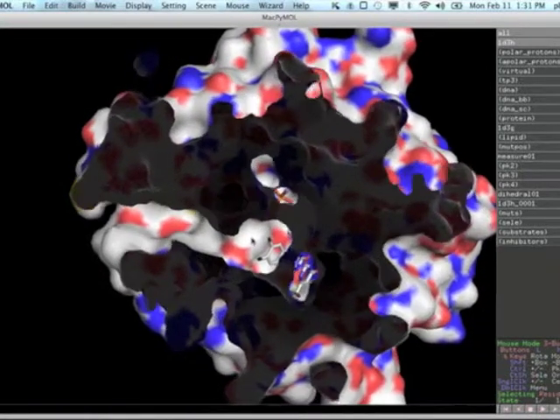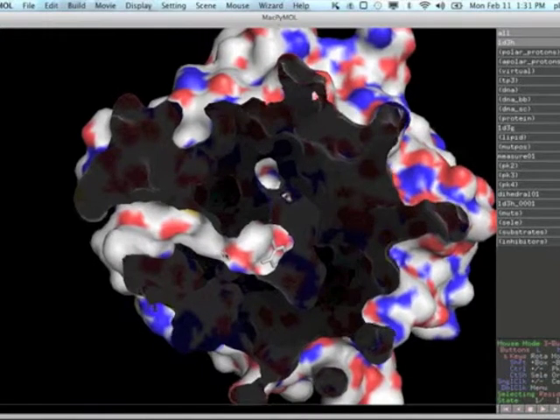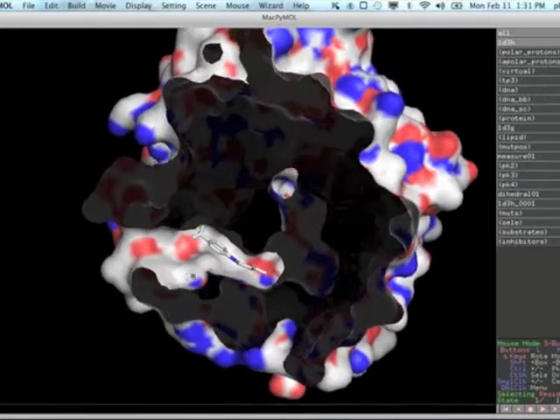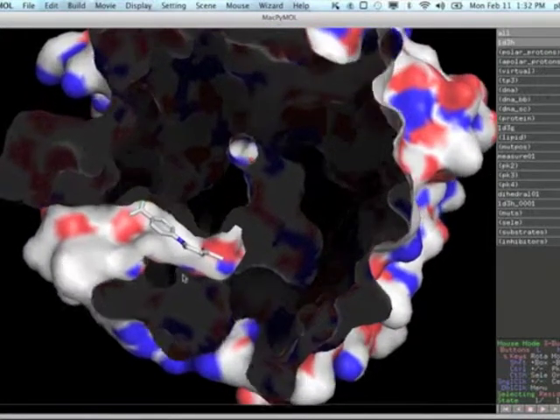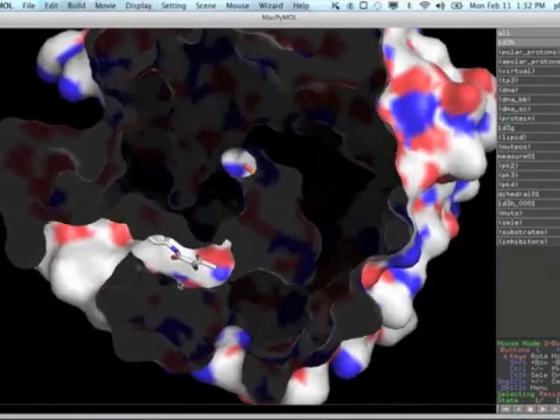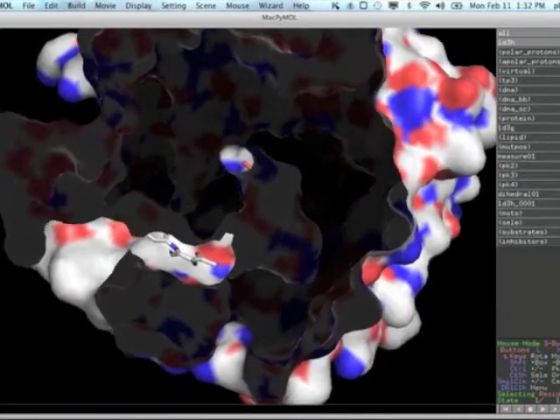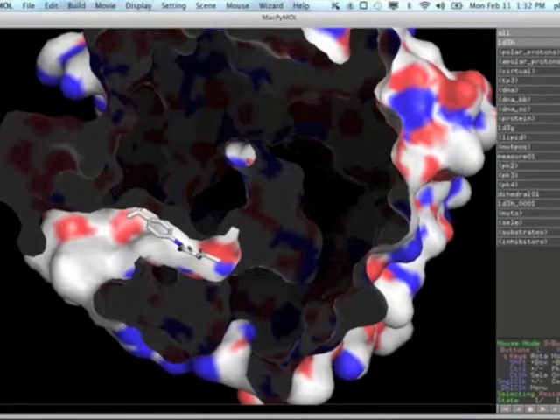These particular structures were solved because scientists wanted to understand how chemotherapy agents that target this enzyme actually work. Those chemotherapy agents were resolved as well as the protein and its natural substrates. So if we show them here, here's one of them. What's really neat about the structure is that you can see that where this small molecule, this drug, binds is right in the tunnel, which is an important access point for one of the substrates of the enzyme. So mechanistically, it becomes pretty clear how this chemotherapeutic agent is blocking the activity.